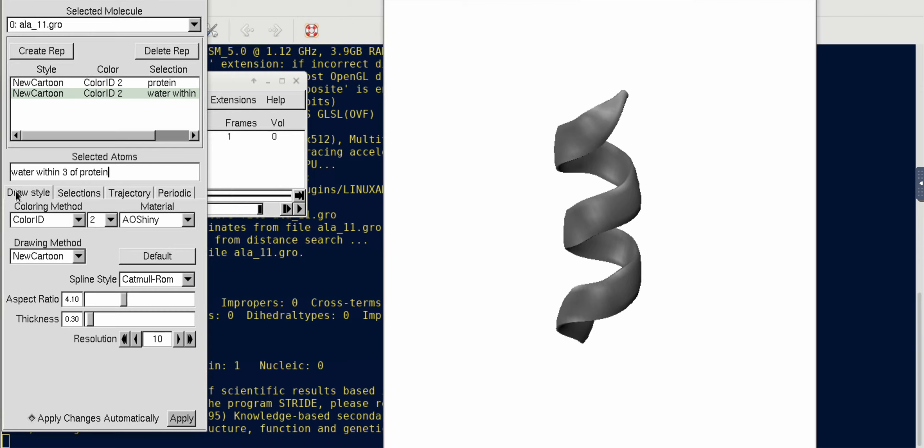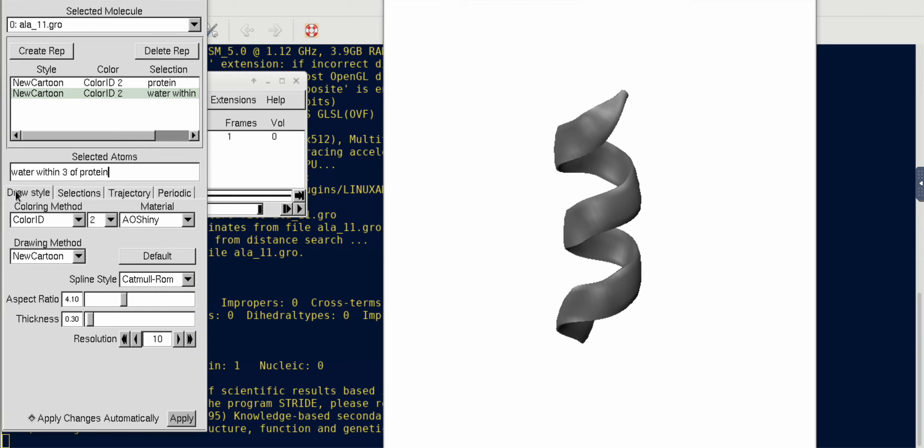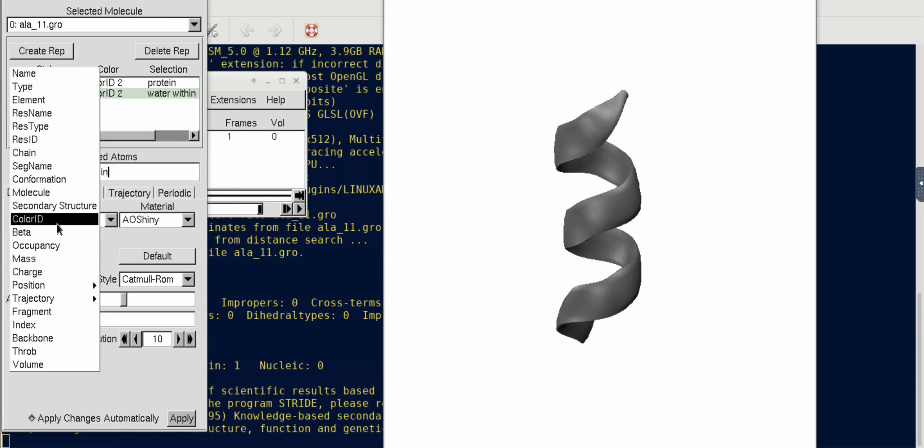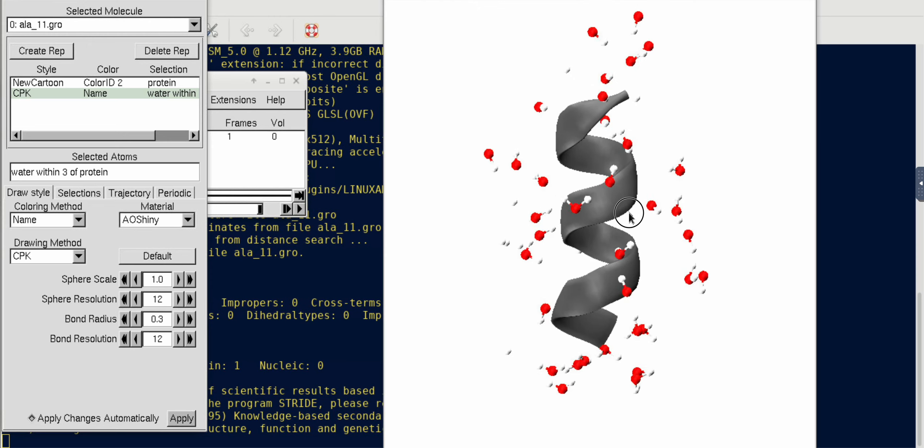Then for the hydration shell I have to create another replica and write 'water within 3 of protein'. This replica will now only show the water molecules that are within three angstroms of the helical peptide.